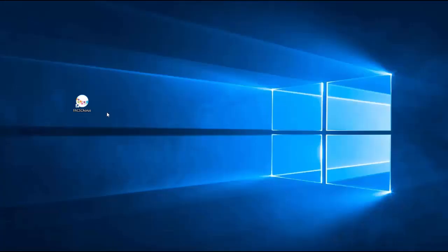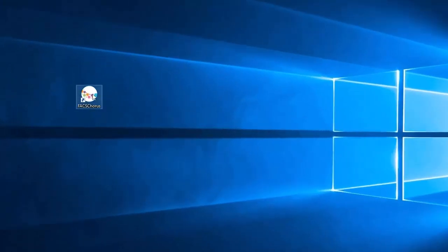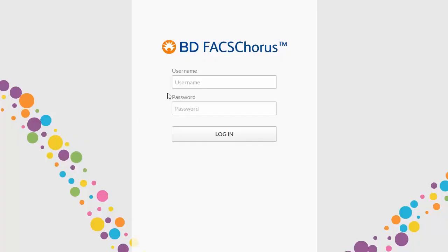Start BD FACSChorus software by clicking the shortcut on the desktop. Log in with a username and password.